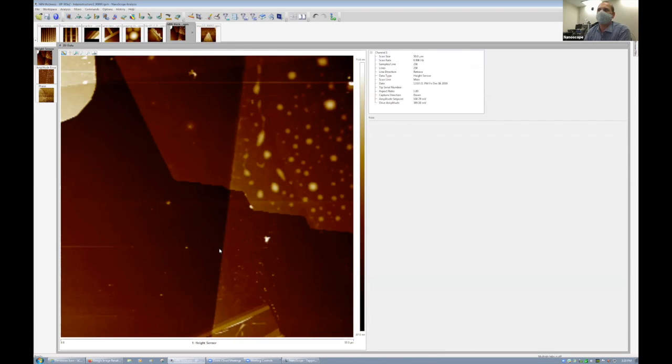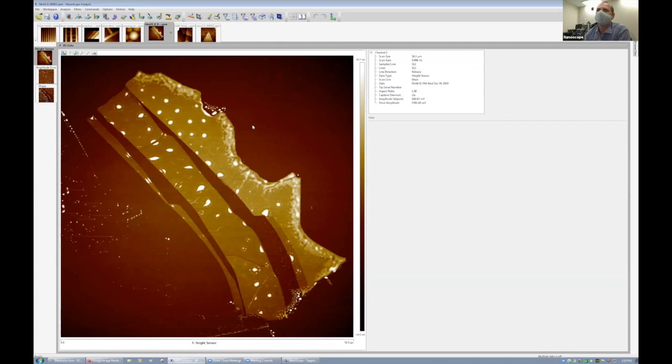Here you have some other material science students looking at how you can layer those different 2D materials. You have a single atomic layer over here, and now you have a single atomic layer on top of it, so over here you have dual layers. You can stack them together and make devices. Here's another one. You can also look for contaminants, which are those bubbles. But like I said, you can also look at organic materials.